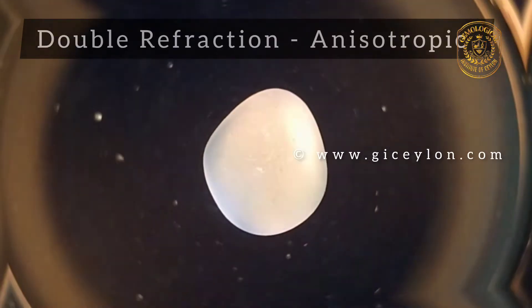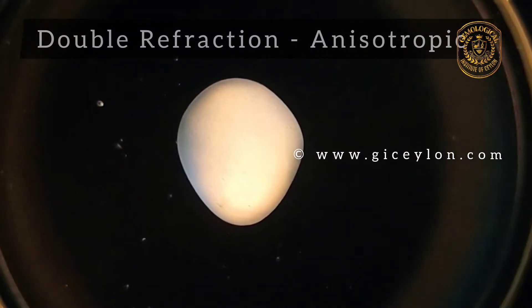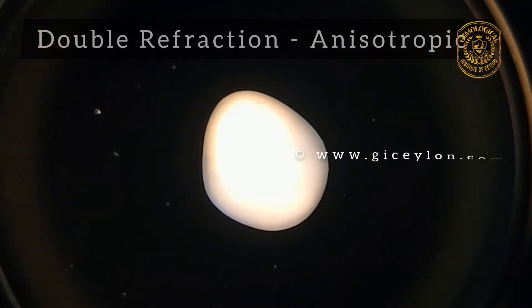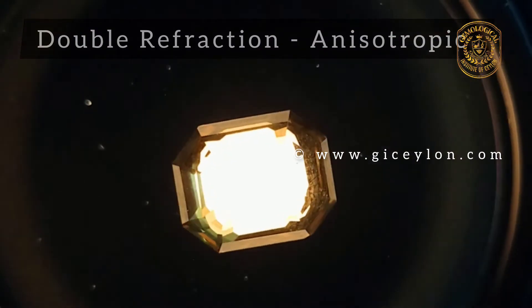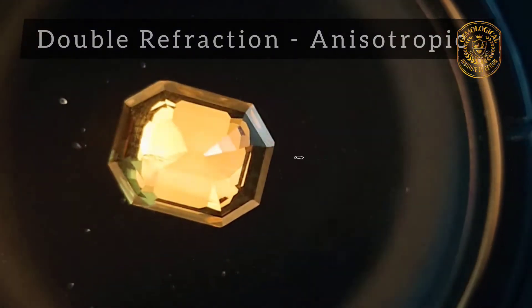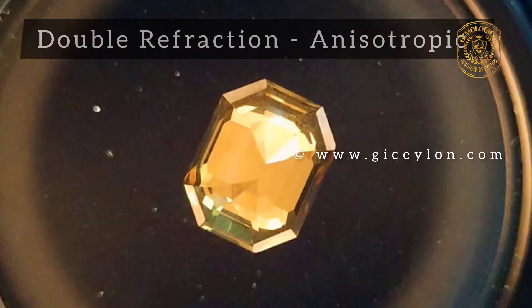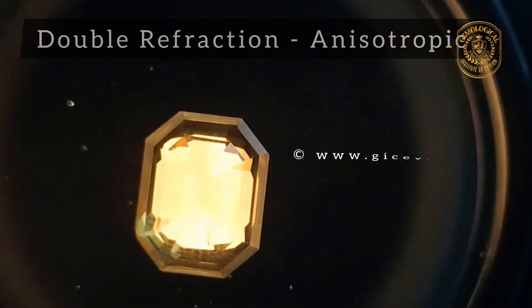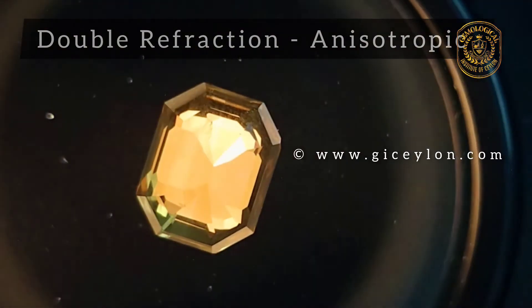Anisotropic stones are doubly refractive. During 360 degrees of rotation, if the sample changes its shade from light to dark eight times, the stone is called anisotropic or doubly refractive. Light entering the stone is split into two rays that are plane polarized along two planes perpendicular to each other. When rotated, the plane of one of those rays becomes parallel with that of the analyzer and hence light emerges from the top, whereas at 45 degrees after appearing light, the polarization planes of neither ray become parallel with the analyzer and hence no light appears. Therefore, the stone will appear four times lighter and four times darker during a 360-degree rotation.